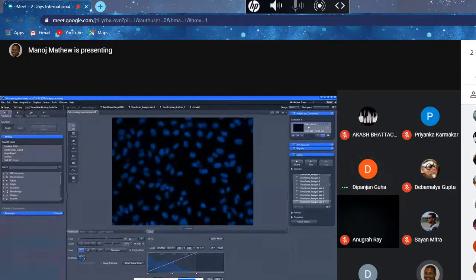Hello? Yeah, so the question is for a specific image analysis problem, right? So you have multiple components, and the question is whether you can differentiate between one component and the other. So image analysis, as I was saying, is a workflow that you have to create, right? So whether a particular software can do this or not really depends on how you can configure the workflow there. So in your particular example, you might want to segment the two objects separately.